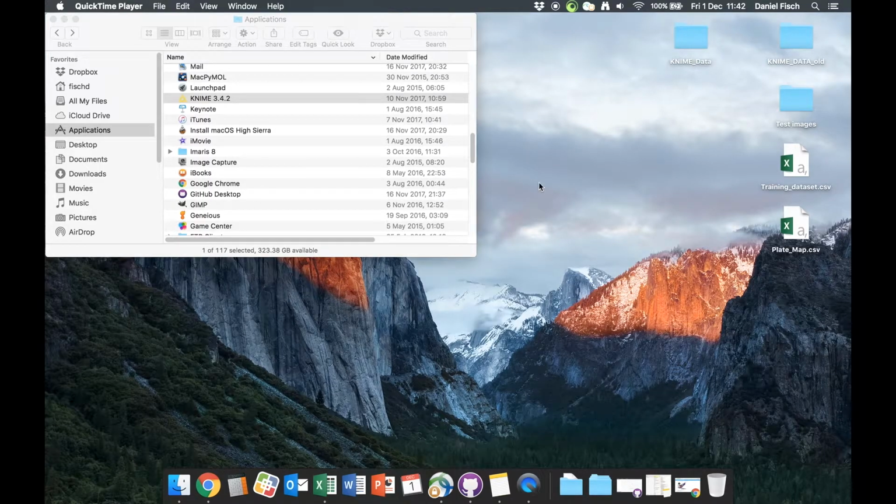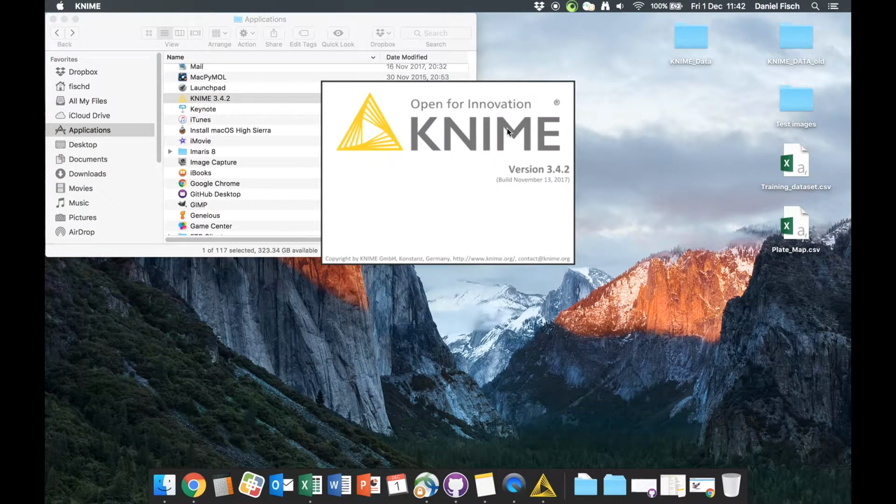You have installed KNIME, created your workspace with all the folders, copy-pasted the HRMAn workflow into it, and adjusted the memory KNIME is allowed to use. You can restart KNIME. Just double click and wait until it has started.